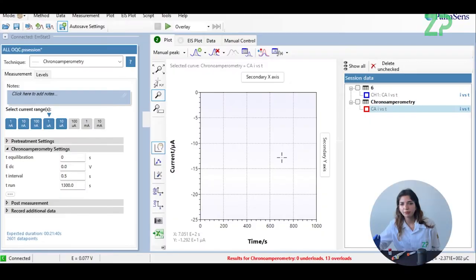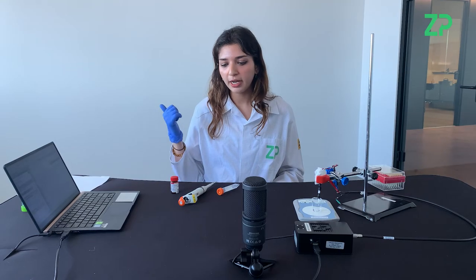We're ready to start our experiment now. Before we press play, let's go over the settings. The technique we're going to be using is chronoamperometry. The current range will be from 1 nanoamp to 10 microamps, but our starting range is at 1 microamp. The equilibration time is 0 seconds and the potential we're running at is 0 volts, because it's a generation 2 sensor so no voltage will be applied. The interval time is 0.5 seconds and the running time is 1,300 seconds, but for the sake of time we're going to apply our titrations once the curve has stabilized at 500 seconds.